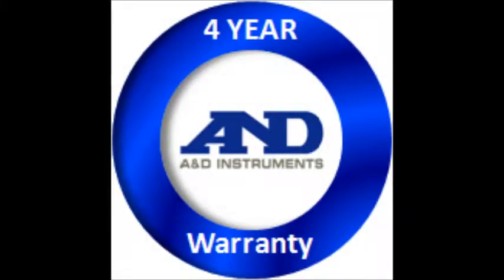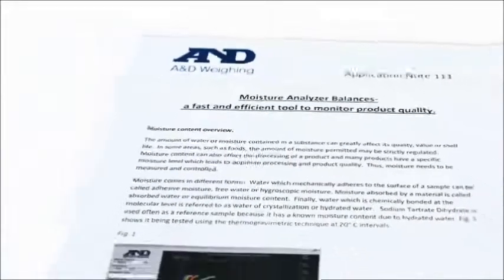A&D Moisture Analyzers are backed by the industry's best warranties and have a proven track record of years of service. They can help you improve your product and your processes.